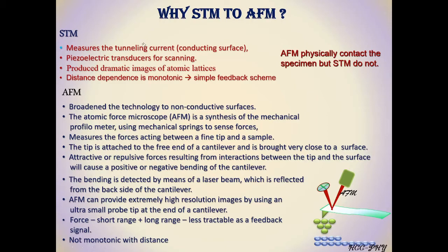It broadens the technology to non-conductive surfaces, and it is a synthesis of the mechanical profilometer, using mechanical springs to sense forces, and it measures the forces acting between a fine tip and a sample. The tip is attached to the free end of a cantilever and is brought very close to a surface. Therefore, attractive or repulsive forces are formed from the interactions between the tip and the surface, and that will cause a positive or negative bending of the cantilever.